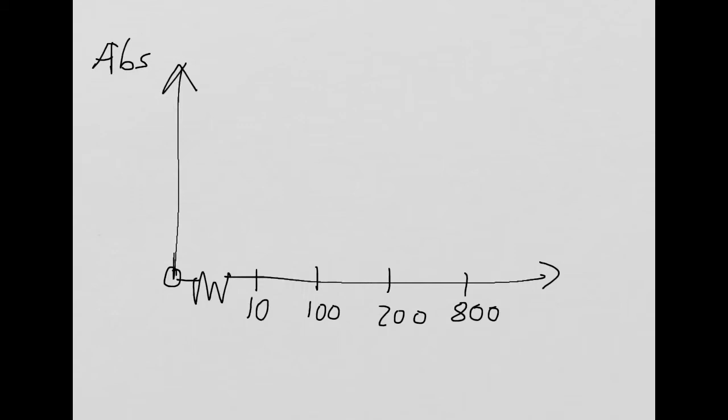I shouldn't say that because that is absolutely horrible. So first of all, it usually takes me a while to figure out what this scribble is. What people usually try to indicate with that is that the axis is sort of interrupted at that point.